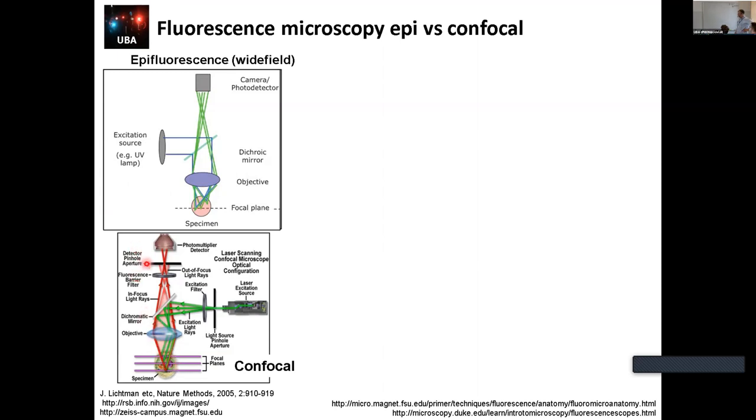This little thing changed all the perspective and enabled us to do Z stacks, 3D volumes, and many other things. It will be very important for tomorrow because this volume is finite. So it's the point spread function. And this point spread function is needed for the fluctuation experiment because we need to know when the molecule comes in and out. In the next slide, I'm going to explain also another way to have confocal without a pinhole.